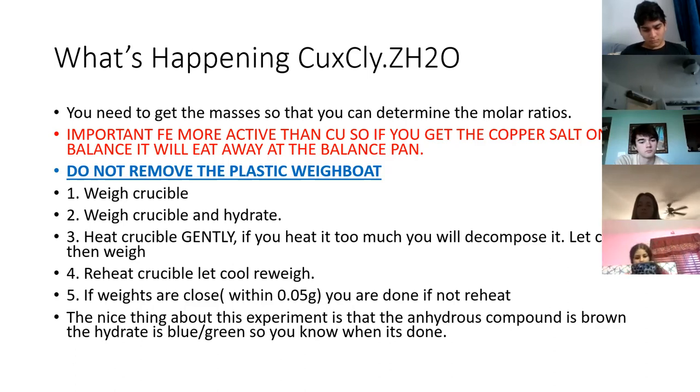Okay? Has anybody ever seen HCl? Obviously, I'm sorry, nobody has seen hydrochloric acid. Has anybody seen pool cleaner, muriatic acid? Yes. What color is it? White. Clear. Yeah. It's clear, right? So if the solution HCl is clear, is the blue color from the CuCl coming from the chlorine?